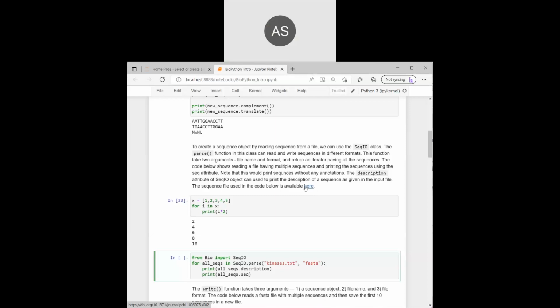See, once you go to this link, you get some sequences, right? Or you can just right click and click save link as. But then you have to give some file name and also a location. Where do you want to save? You can save it on the desktop, in my documents, C drive, D drive. So we have to give only the saving, not the PWD command? No, not the PWD command. That is just for your information about which location you should save. Actually, I thought that was the present working directory. No. Okay, fine, sir.